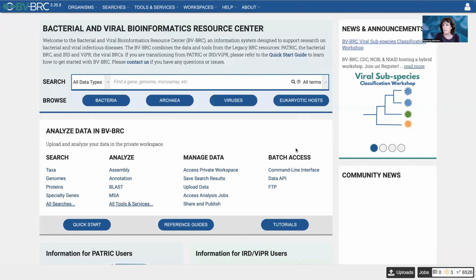We did taxonomic classification, ran that Kraken analysis, and we could see all those bacteria that were found in that sample from the patient who had had a kidney transplant. Well, after we figured out what's there, let's see what we can pull out of it.